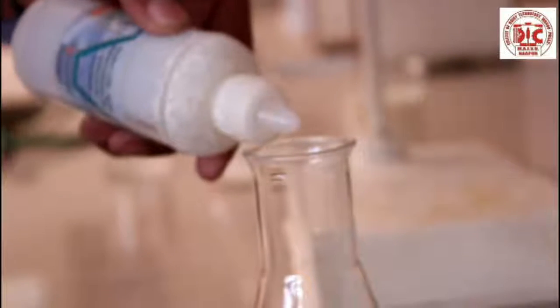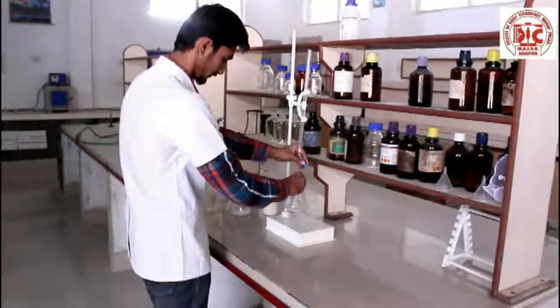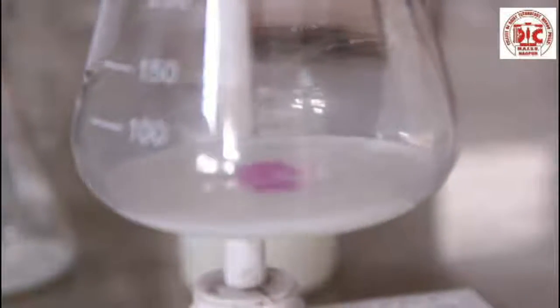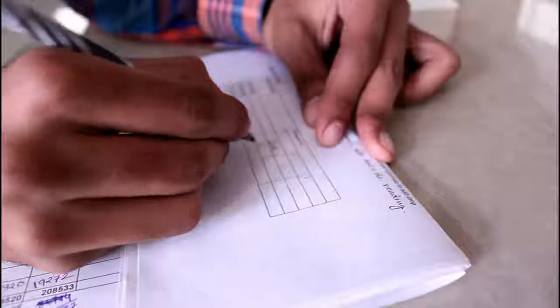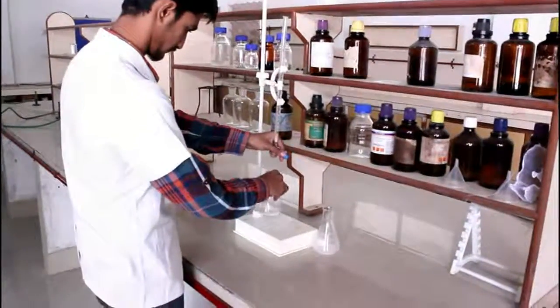Add a few drops of phenolphthalein to one 10 ml of milk. Rapidly add 1 ml of 0.1 normal NaOH solution to milk containing phenolphthalein and continue to add drop by drop until, by comparison, it matches the pink tint of the blank. Note down the reading. Repeat the experiment to get concurrent values.